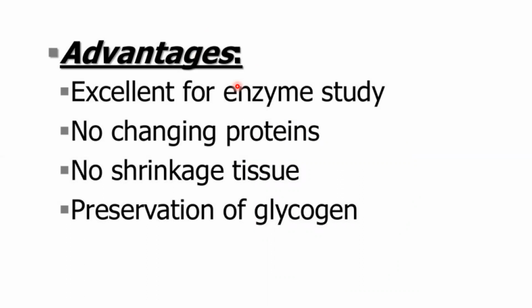It is excellent for enzyme studies. There won't be any change in the proteins. There won't be any shrinkage of the tissue, and it is also able to preserve the glycogen deposits within the tissue. So these are the major advantages of freeze drying.